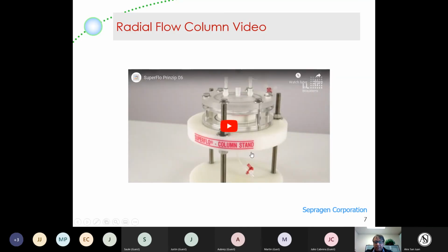So we'll show you a little video. This is one that a distributor in Europe made. I'll share this with you. I think it illustrates very well the principle of the radial flow column.